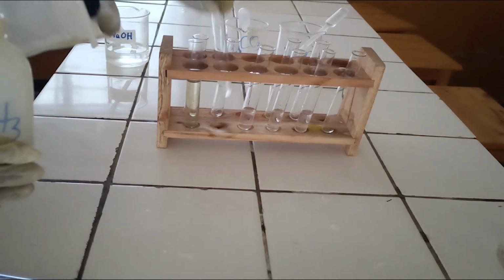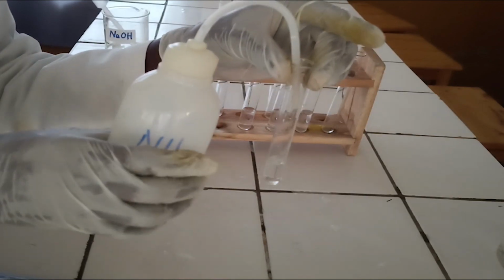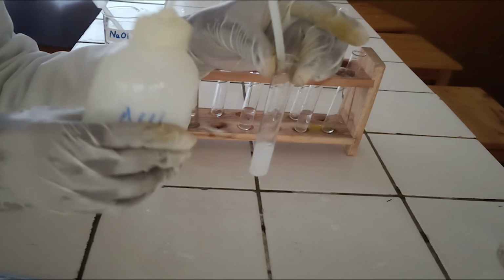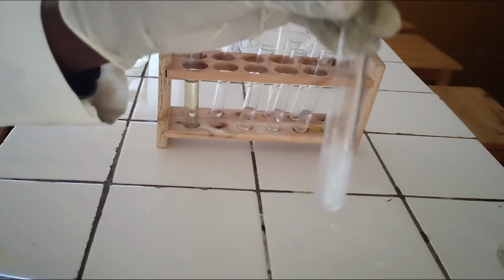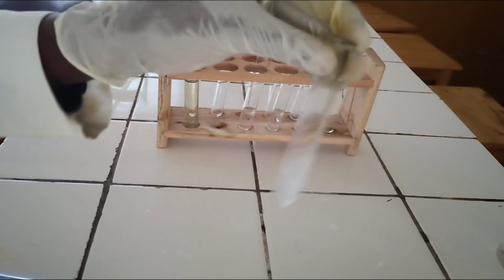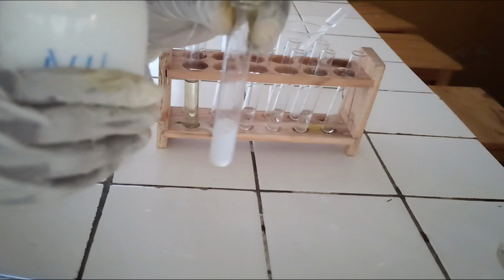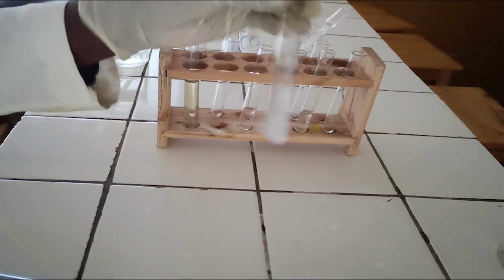To the second test tube, add ammonia solution dropwise until in excess. As you see, ammonia reacts with zinc ion to form white precipitate, which is soluble in excess of ammonia. Below, there is ionic equation for this reaction.